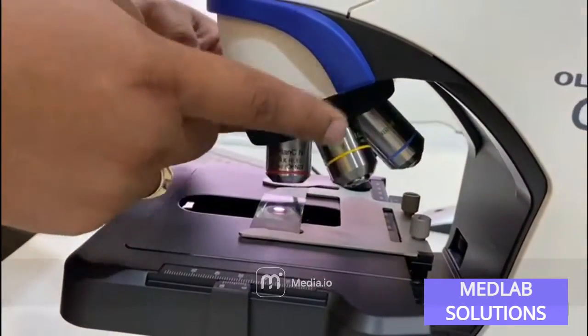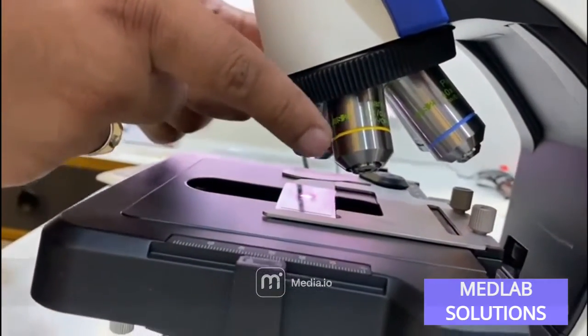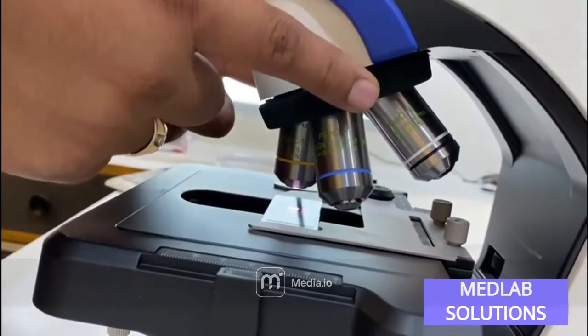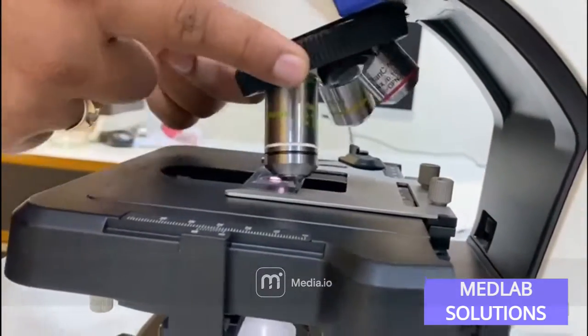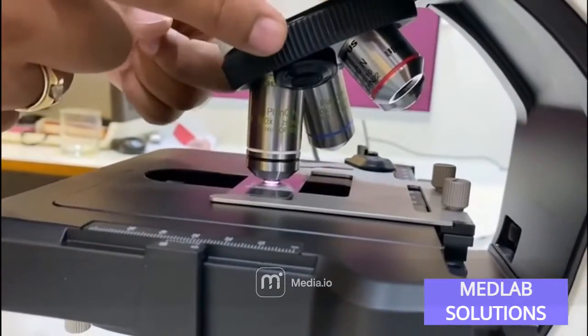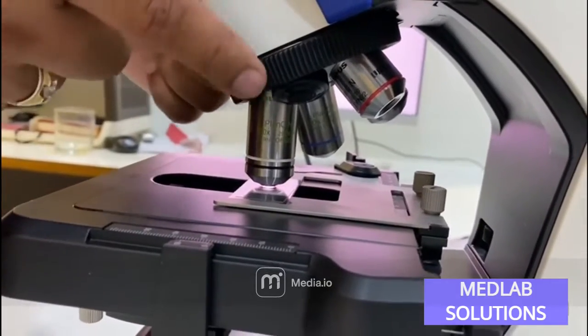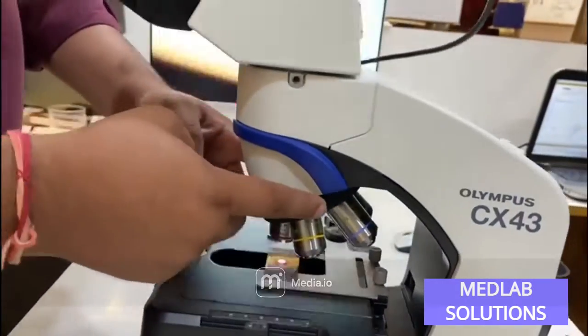You get a five-position turret. It includes a 4x bright field objective, a 10x phase contrast objective, a 40x phase contrast objective, a 100x phase contrast objective, and a fifth position where you can place either a 2x, 20x, 50x, or 63x objective.